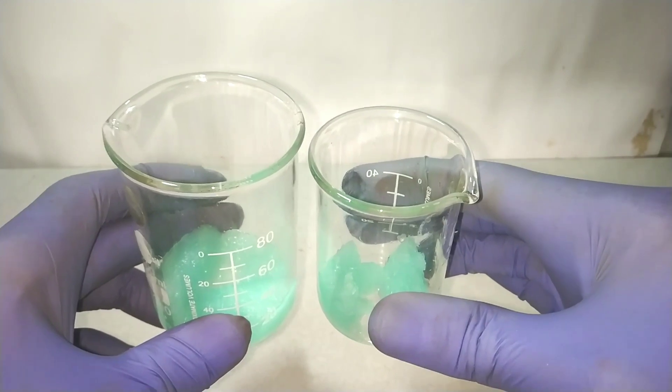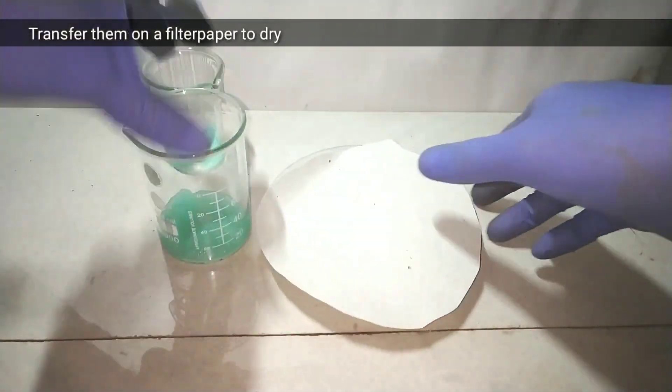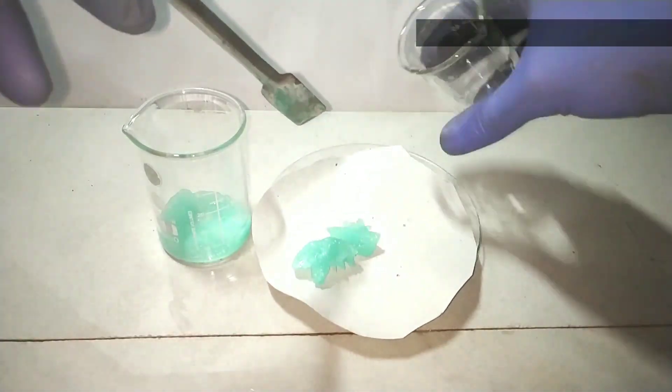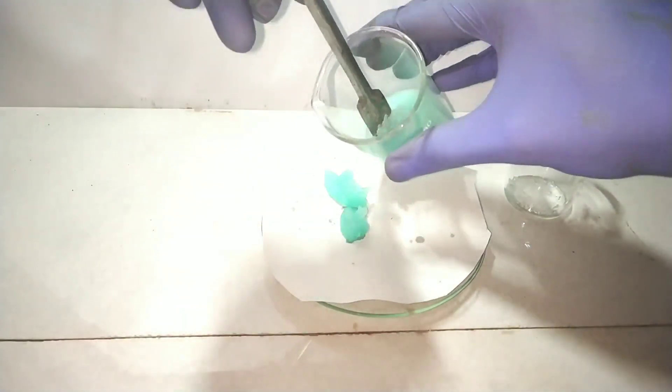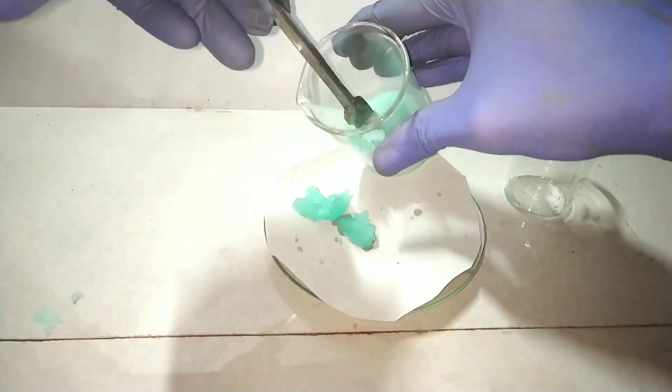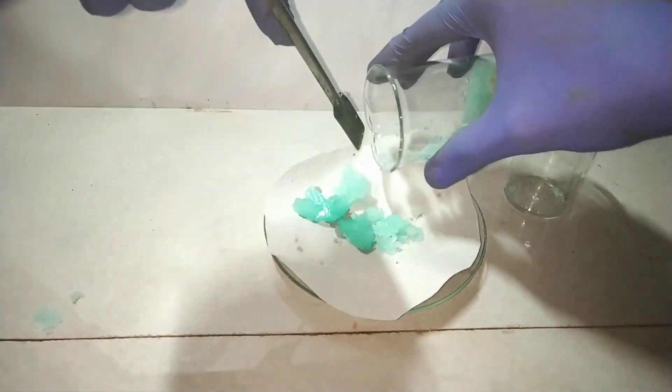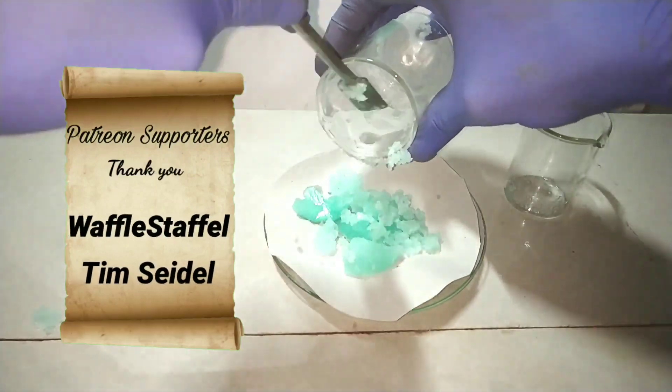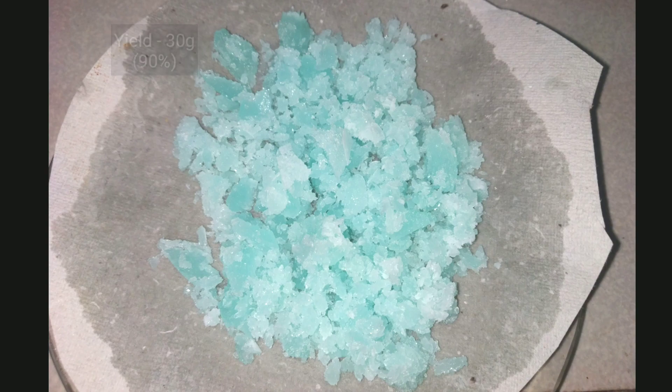Now I will be transferring the ferrous sulfate into a piece of tissue paper or filter paper to dry them, and then we will be weighing them to use in preparing our Mohr salt. I got a yield of about 30 grams.